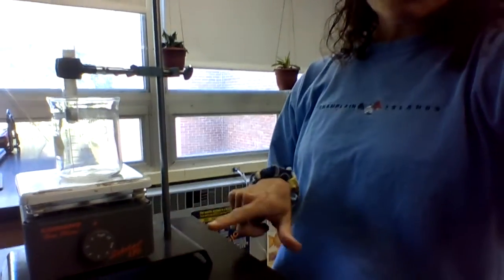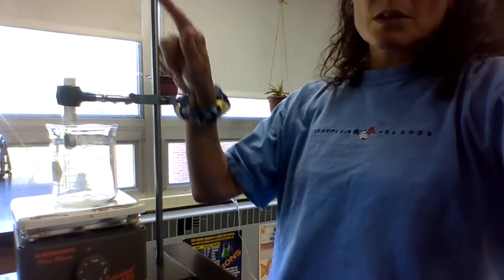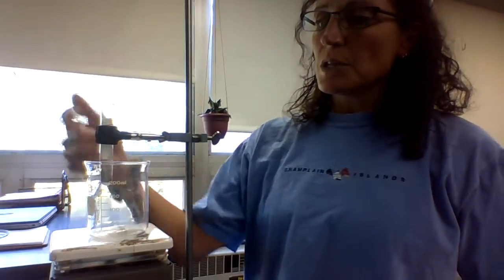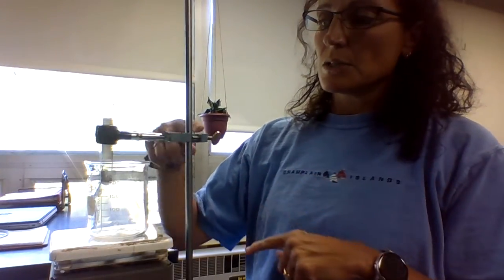So here is the base, here's the long pole, but I actually have a hot plate here to simulate a lab activity. And then there's a beaker and this is a test tube clamp.